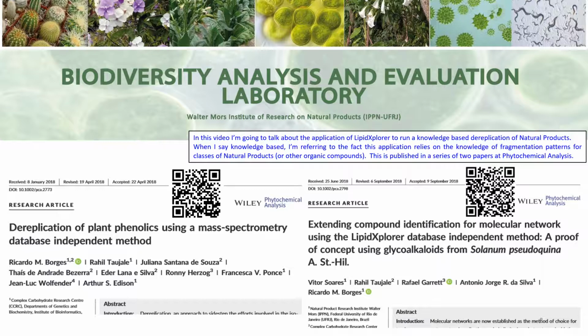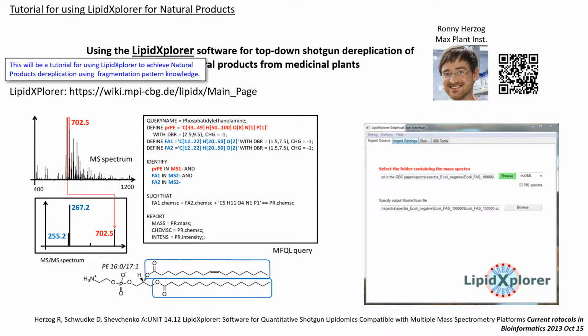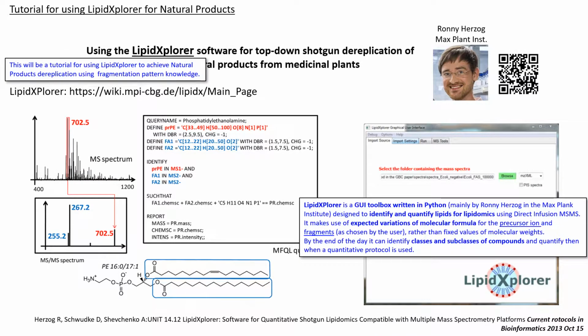This is published in a series of 2 papers at Phytochemical Analysis in 2018. So this will be a tutorial for using LipidXplorer to achieve natural product dereplication using fragmentation pattern knowledge.